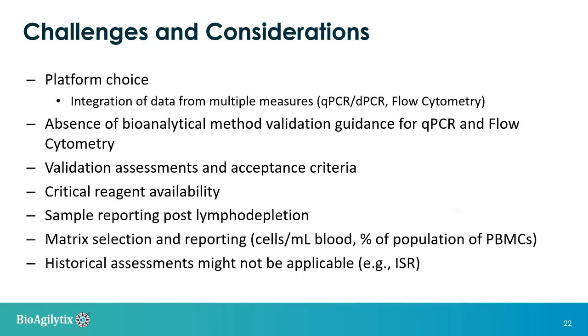Some of the challenges of understanding cellular kinetics and performing some of these assays is that integration of data from multiple platforms or measurements is sometimes needed. One of the biggest hurdles, I think, in this space, especially in the molecular space, is there is an absence of bioanalytical method validation guidance from regulatory agencies or health authorities for PCR, which adds some ambiguity to how these assays are developed, how they're validated, and what acceptance criteria are appropriate for them.